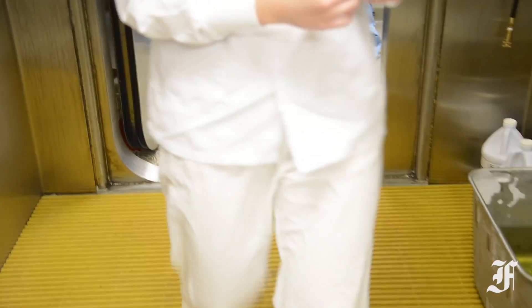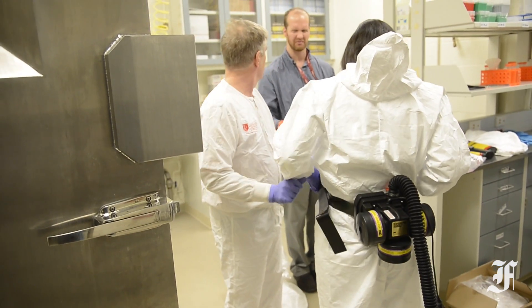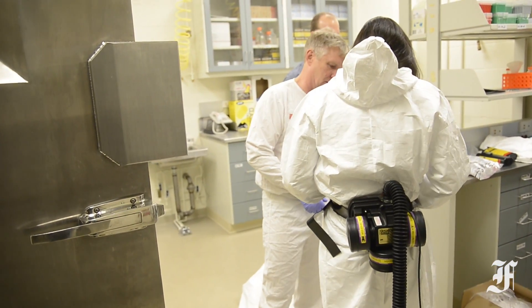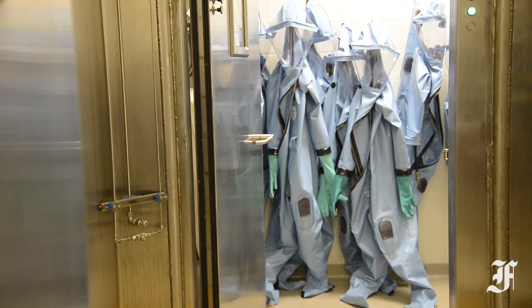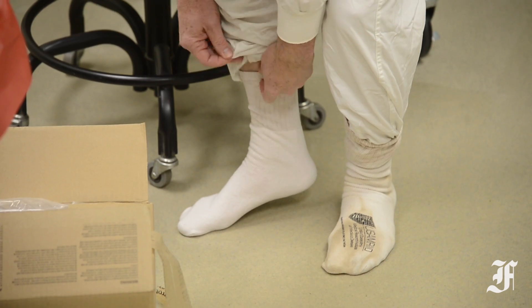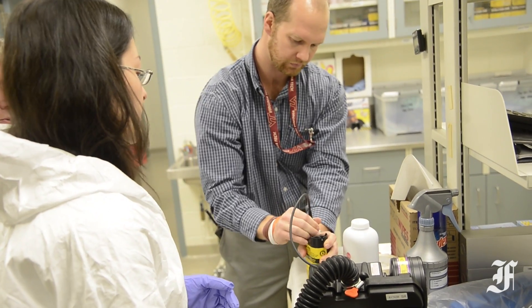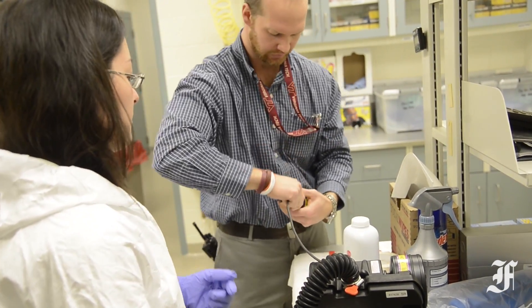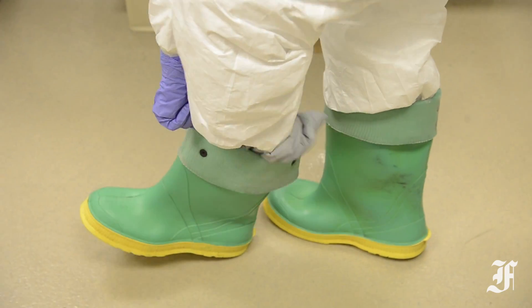Officials at USAMRID recently allowed a reporter with the Frederick News Post to don the type of suit worn while working with Ebola in a clinical setting, which differs from the rubber spacesuit-like ones used in the controlled environment of the Biosafety Level 4 labs found at Fort Detrick. It is this type of equipment that USAMRID officials recently trained members of the 101st Air Assault Division to use before they were sent to West Africa to help control the outbreak there.